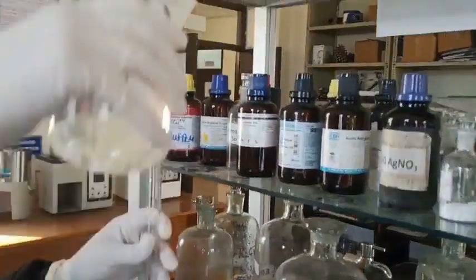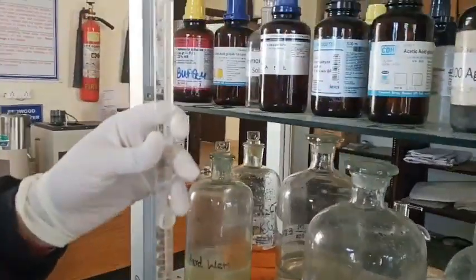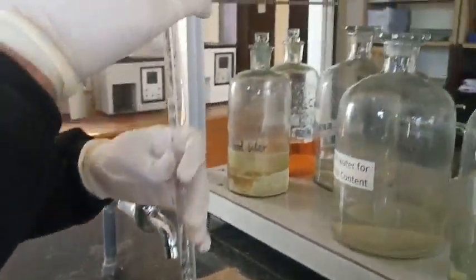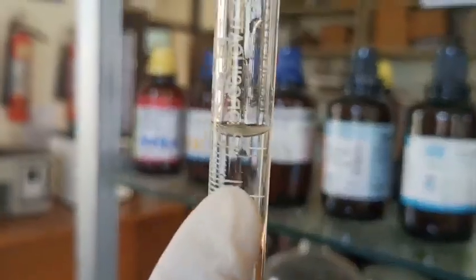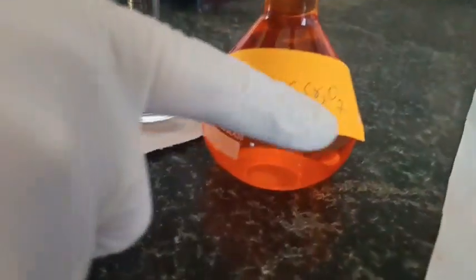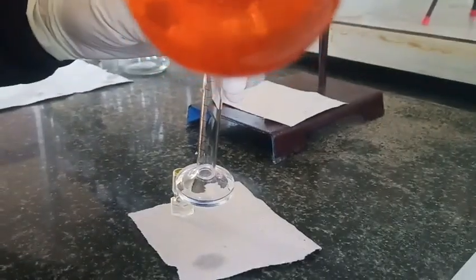Now I am going to fill it. Fill this nozzle also, right? Don't bother about the mark. Now make it up to the mark. Now this sodium thiosulfate solution is going to be titrated against, or standardized against, K2Cr2O7 solution.